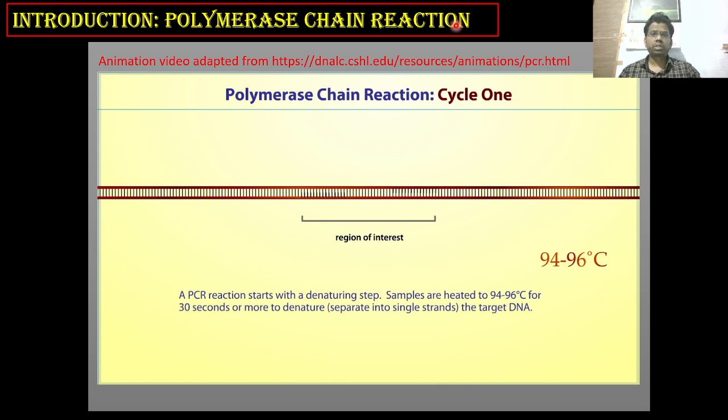The first question which comes to our mind is, what is a PCR? So PCR is basically a thermocycler machine. In this machine, a different gradient of temperature is utilized to amplify a particular segment of a DNA into millions and billions of copies. So in this polymerase chain reaction, the main and the most important component is the temperature. So each temperature is responsible for each step in the PCR.